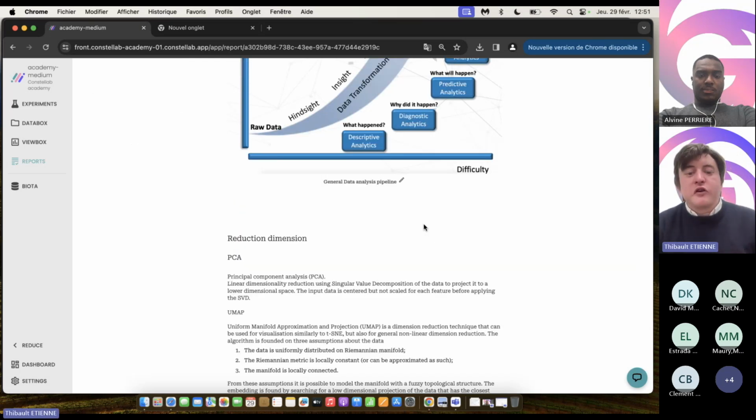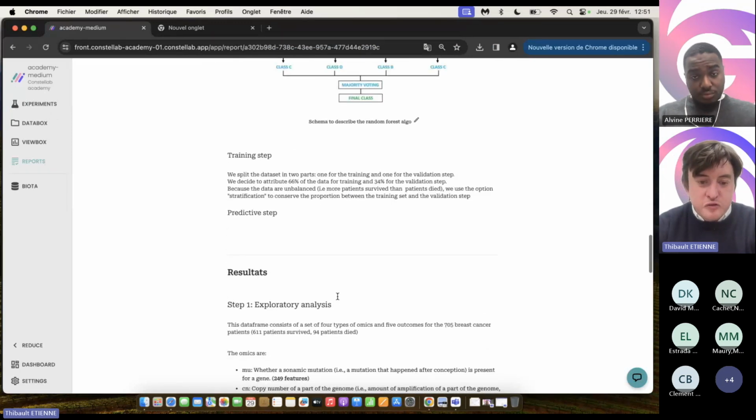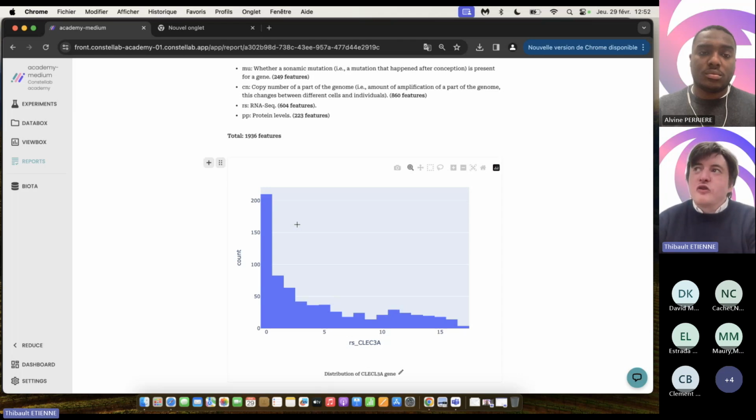In this report, we don't go into the detail, but I present the method differently. For example, here we can retrieve the interactive plot I produced, and it is important that in this report it is still interactive. So, for example, another user, a customer or a colleague can directly explore the results in the report, and it's not necessary to go inside the pipeline to check or to obtain an image. We can directly connect the output of the experiment here.